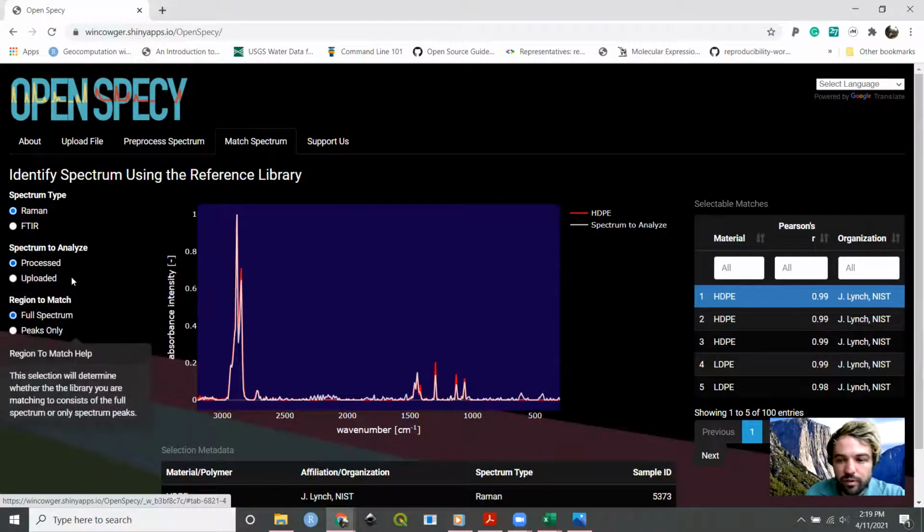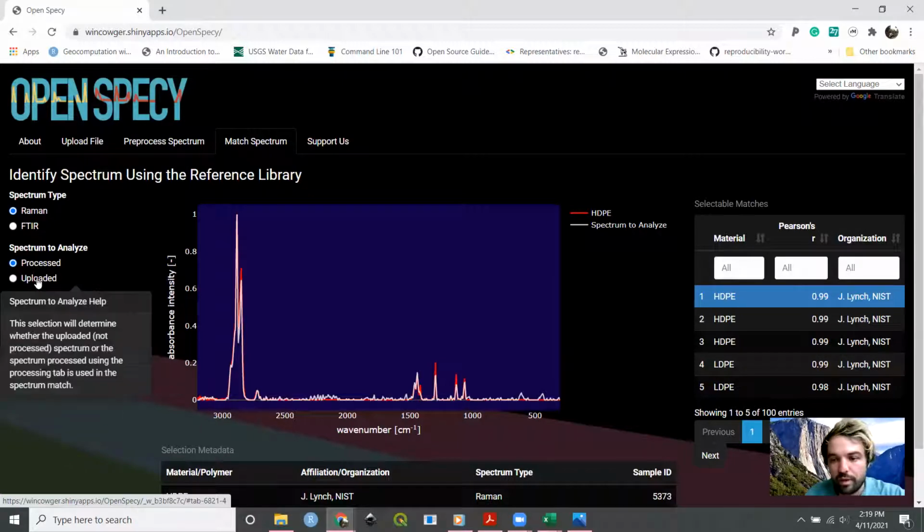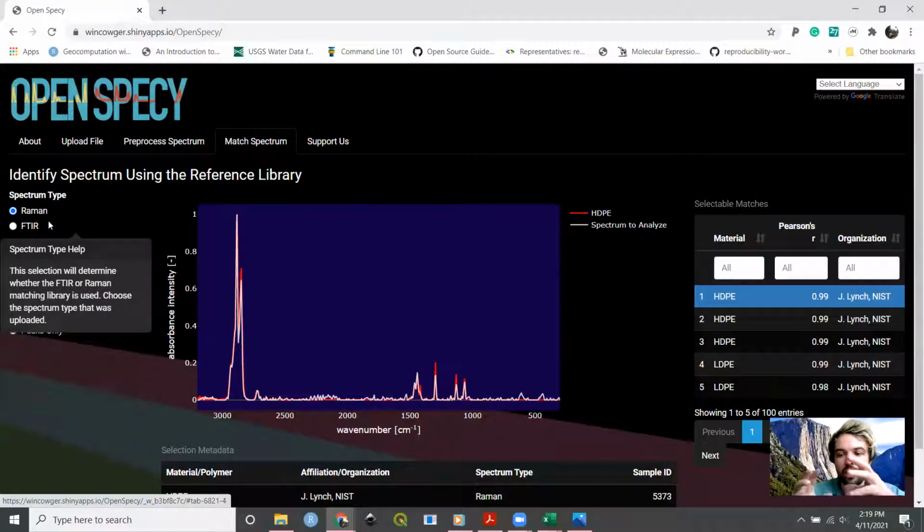So I'm just going to leave this. These are the default settings. We calibrate all of OpenSpecy's procedures to default settings that are going to be above 90% accuracy. And how we do that is we take OpenSpecy's library and we take each reference spectrum out of the library, augment it to kind of distort it a little bit using basic principles of spectroscopy.